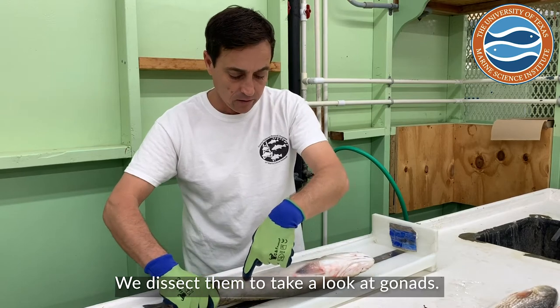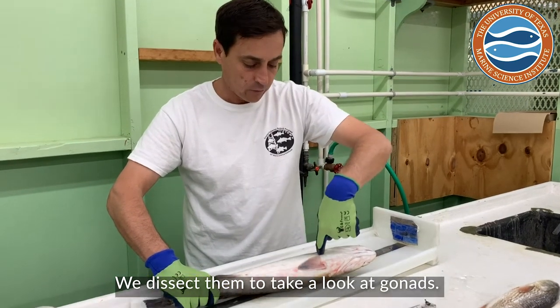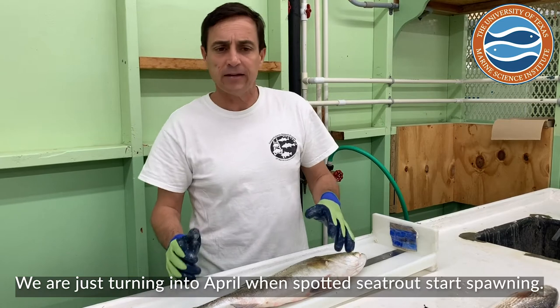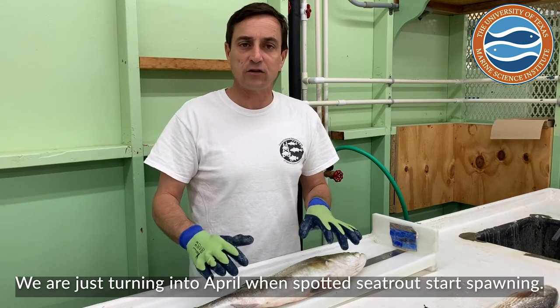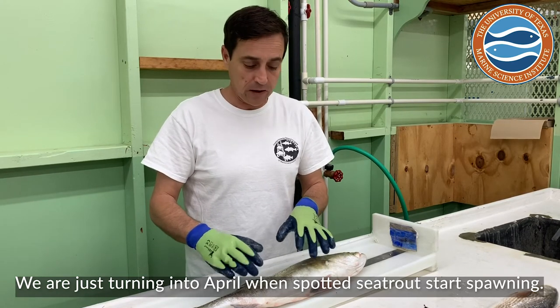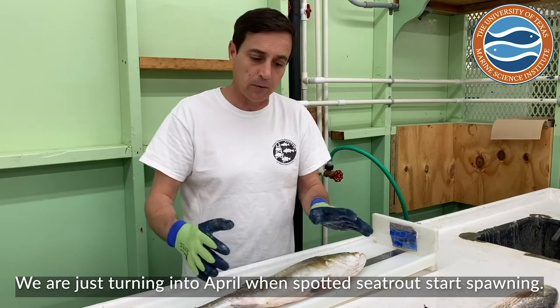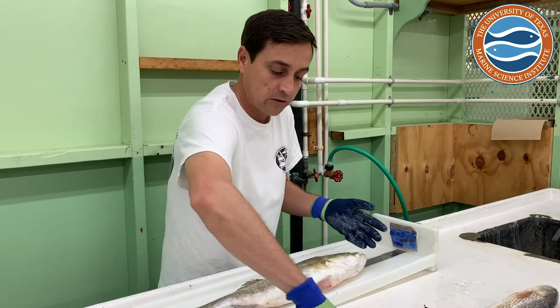We're going to make an incision here at the urogenital opening all the way up to the belly, and that allows us to take a look at the gonads. This is interesting because we are now just turning into April, and this is just about the time when spotted sea trout start spawning. We expect to see some evidence that the reproductive organs are developing and getting ready to spawn. It's been a warm spring, so maybe they're starting to spawn.